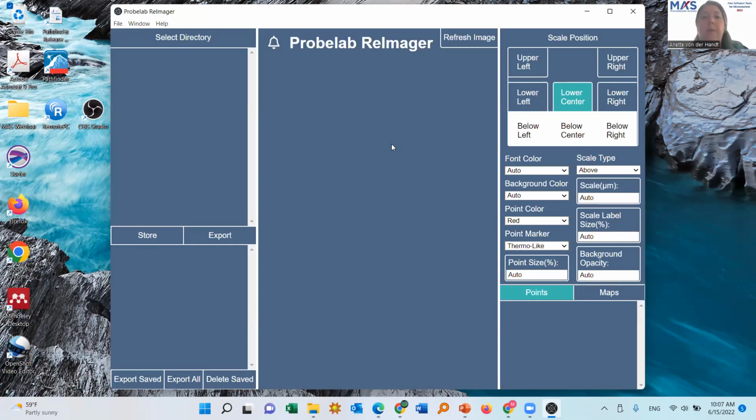So specifically when it comes to creating more customizations, we often like to just have the users play with colors and things and stay away from the main instrument computer, and this helps with that.